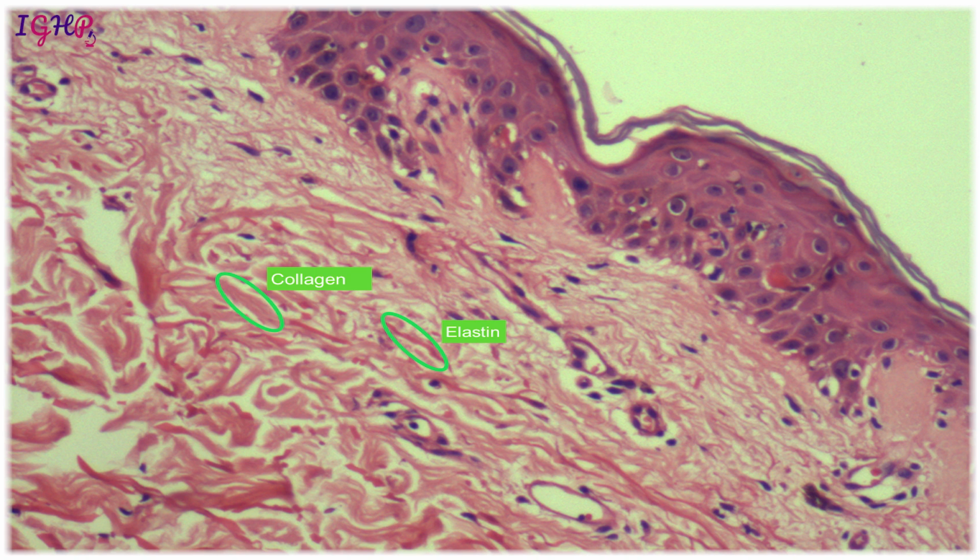Now in this supporting meshwork, you see the presence of blood vessels, and these blood vessels are being supported by the collagen and the elastin fibers which are present in the dermis. So even on an H&E, your routine histology stain, you will be able to identify elastin fibers and the collagen fibers. Then if you want to confirm the type of fibers, you can go ahead with your special stains, and then you can confirm and type the different types of fibers.